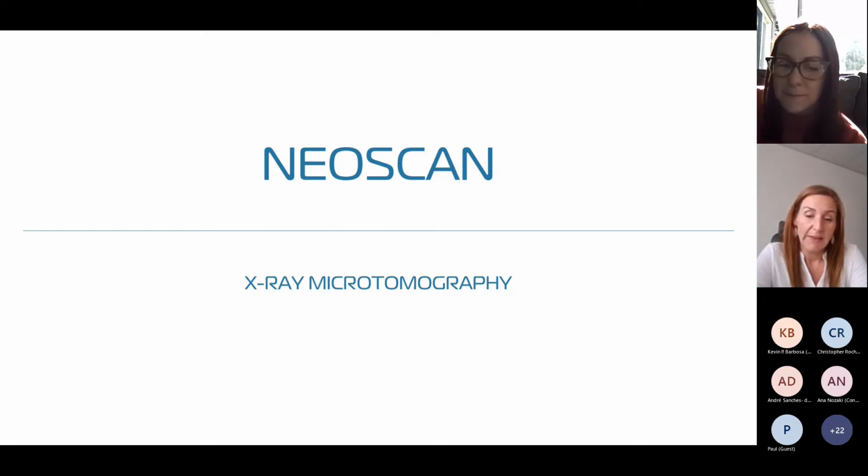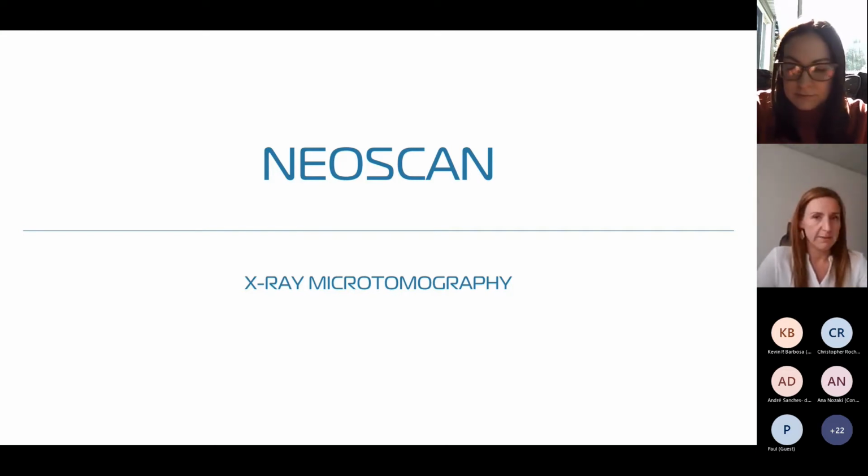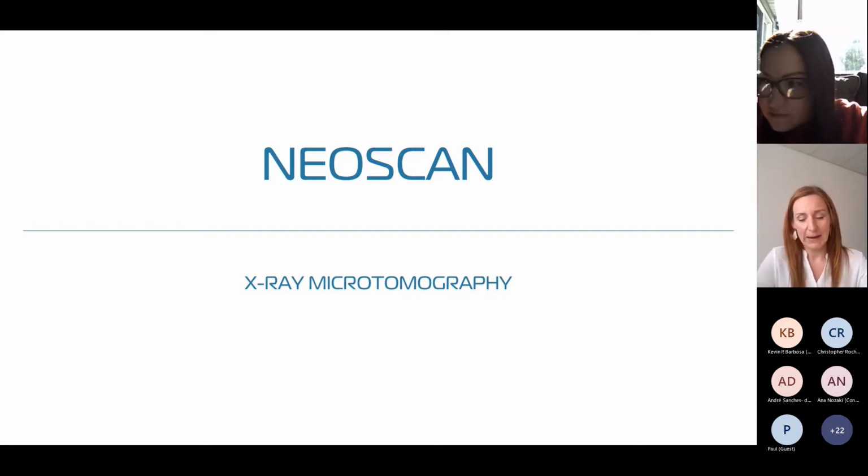Okay. And then the second question was about the applications: what about other biological samples? Correct? Yes, correct. Okay. When it comes to biological samples, there is a huge variety of what you can put inside the scanner. Basically, if you can put it in, you can scan it.